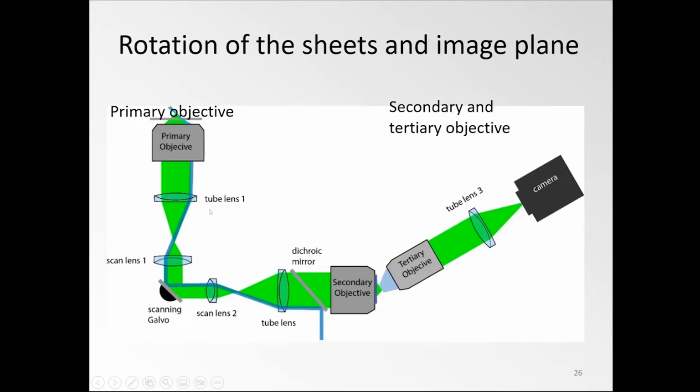Let's just talk a little bit more how that then works in the microscope. So we insert the rotator in the OPM, here in the image space. So it rotates the structured light sheet and it derotates the fluorescence. So similar to the galvo, which scans the light sheet and descans the fluorescence, this device rotates and derotates. And so the camera would never notice that the light sheet has rotated or that it has been scanned.